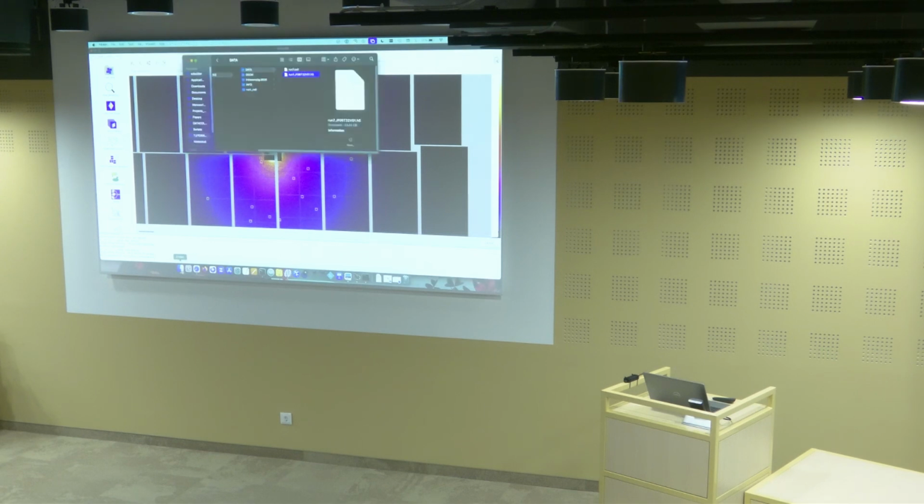So if you look at what's happening right now, this is my output folder. It generated an additional folder which is called indexamajig, which is the major program for indexing in CrystFEL. That now has 12 workers running for me since I asked for 12 threads. And we have an output folder which is called run1 cell. That is the file that I gave. This contains some information, so just a copy of the geometry, a file list, so with the input file. Then this Miller data is something that's written out to optimize your detector geometry afterwards if you want.